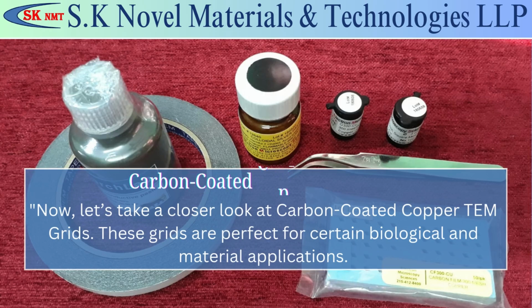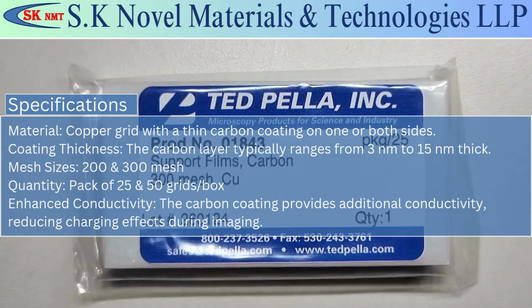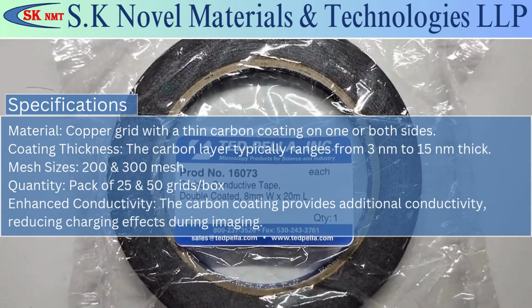Carbon-coated copper TEM grids. Now, let's take a closer look at carbon-coated copper TEM grids. These grids are perfect for certain biological and material applications. Specifications. Material: copper grid with a thin carbon coating on one or both sides.